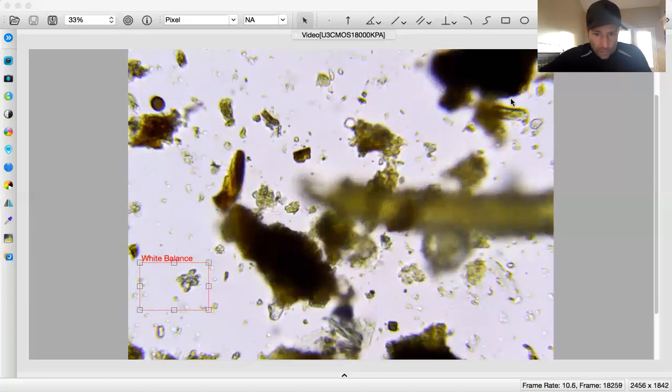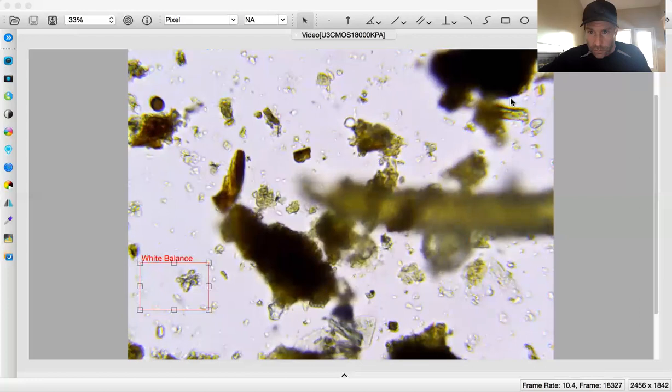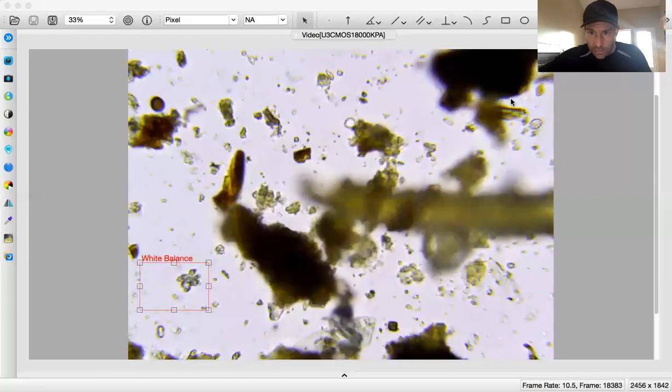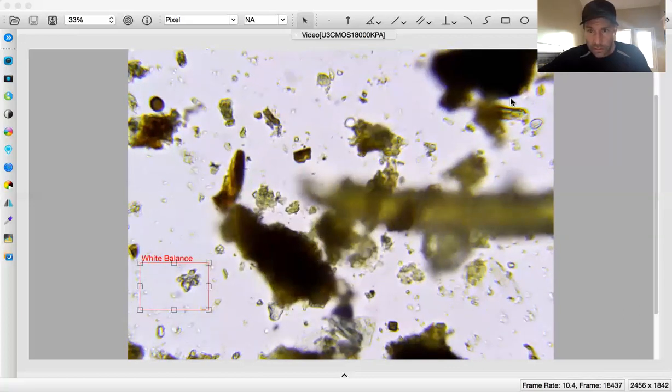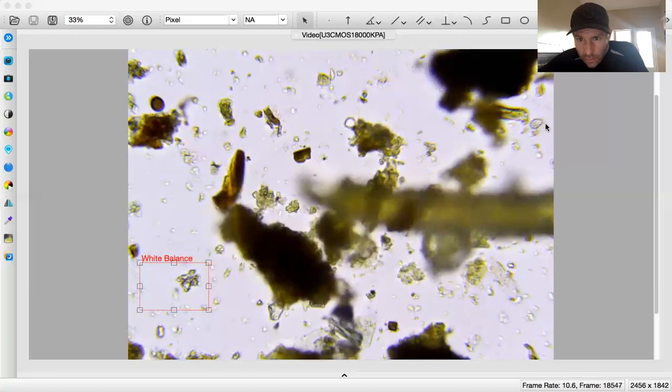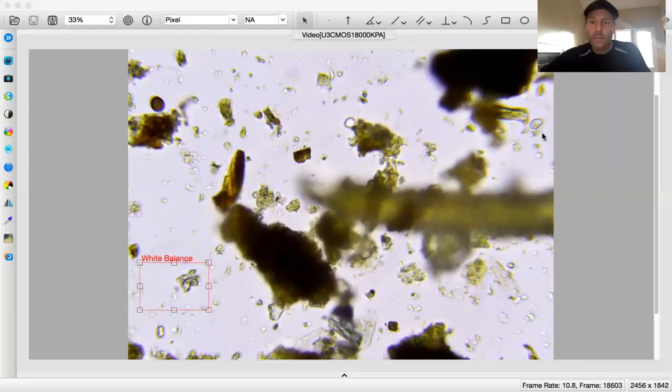I am not seeing anything else. Is that him? Oh, come on, give me some slack here. Well, you guys saw that motion. That was a whipping motion, so I think we can all agree that was a flagellate, so I can move on there. I'm wondering if this is a small testate, but that is pretty tiny if it is. At 400x, that is the size of a spore.